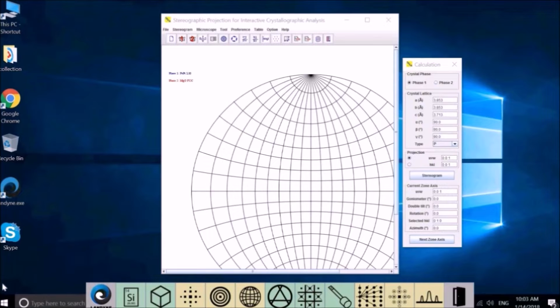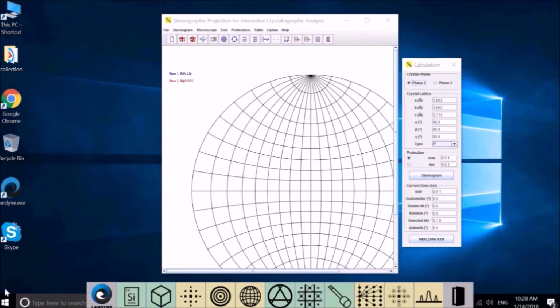The Landyne software suite is distributed with a collection of structure files, so you can use SPICA 3 immediately. For calculation of stereogram only, the lattice parameter is enough in the input file. The software can also calculate a diffraction list, for which the information about space group and atom coordinates is needed. In addition, the structure file can also be used in all software components in the Landyne software suite.